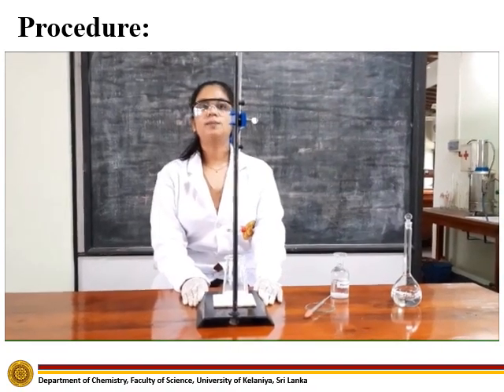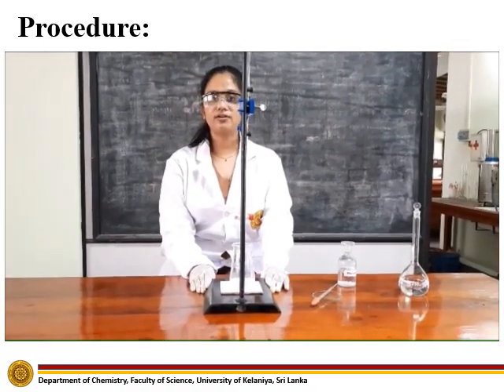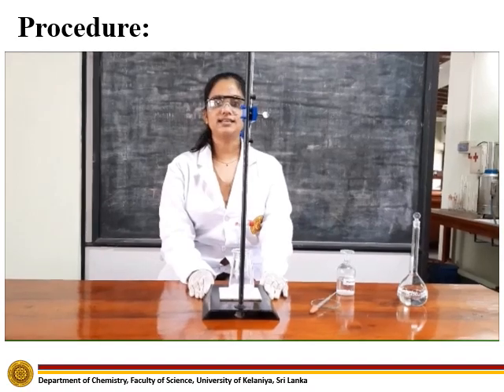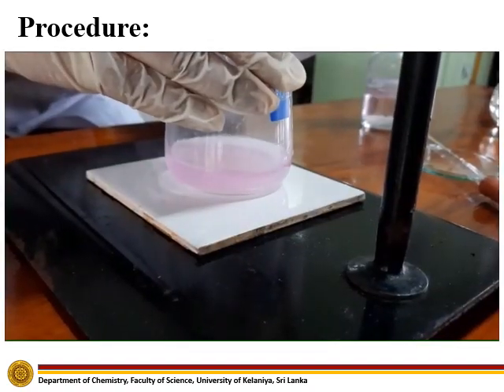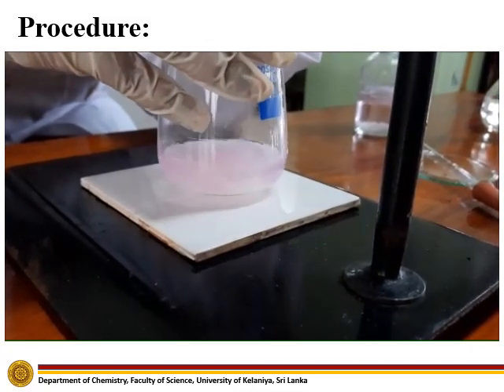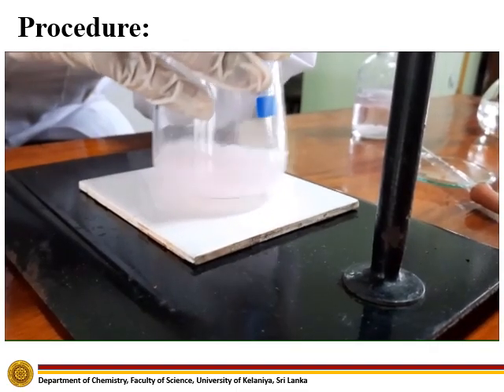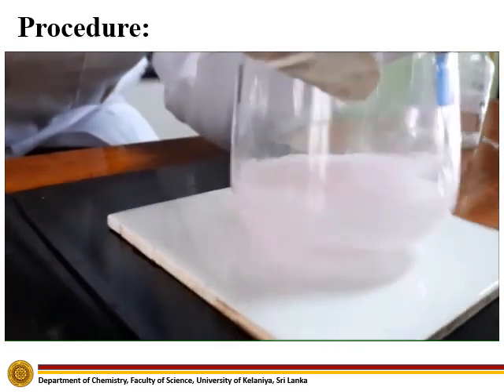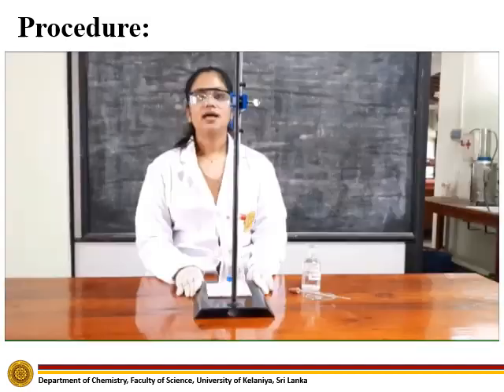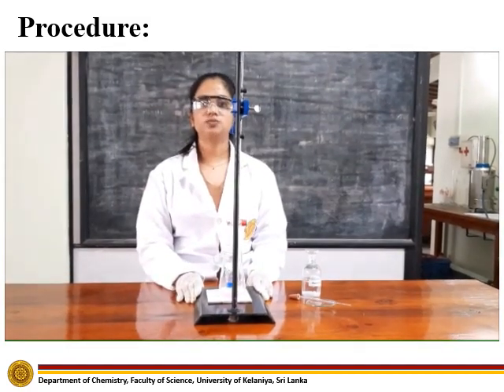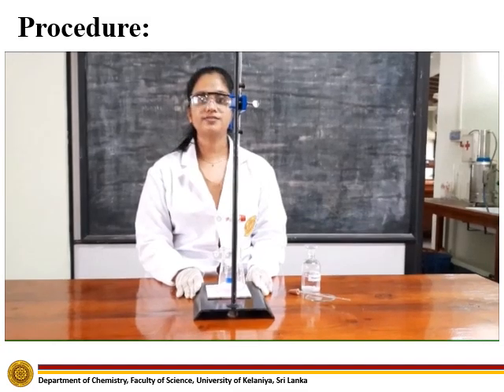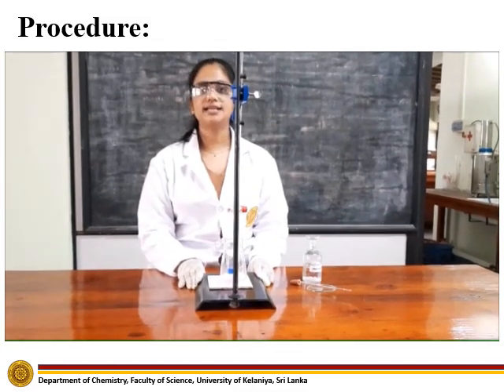Now let's get 25 ml of stock solution of calcium hydroxide prepared from 0.05M calcium chloride and titrate it against HCl and record the burette reading. Now let's titrate 25 ml of calcium hydroxide solution prepared from 0.025M calcium chloride solution against HCl solution and obtain the readings.